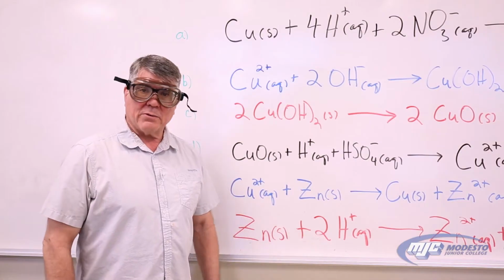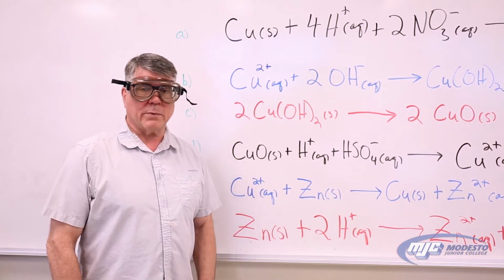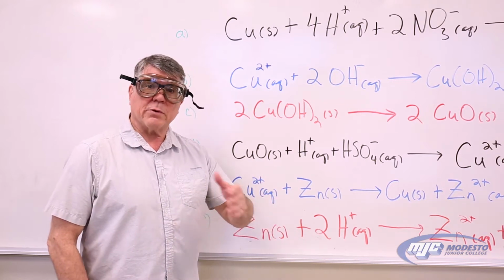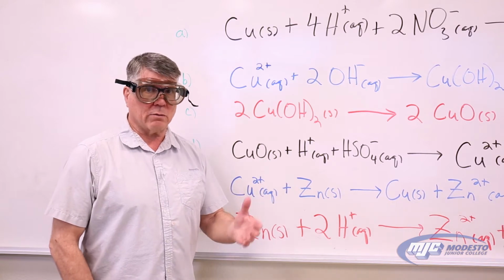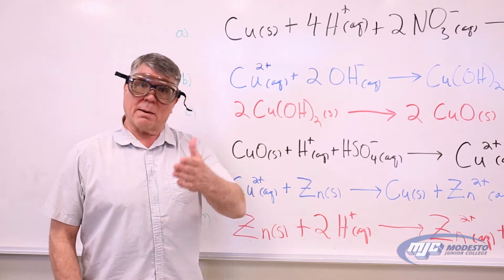All right, guys, I'm Dr. Cadell, and this is the cycle of copper reactions. So in this experiment, you take some copper, weigh it out, and perform a series of chemical reactions on it. It'll transform each time and look quite a bit different. At the very end, we're going to get that copper back out.